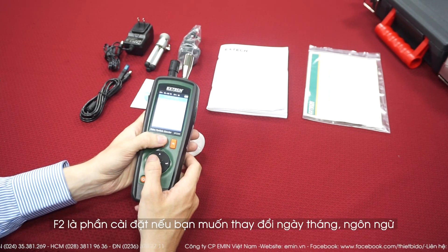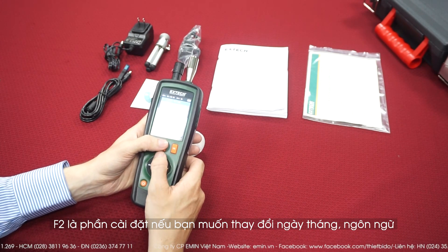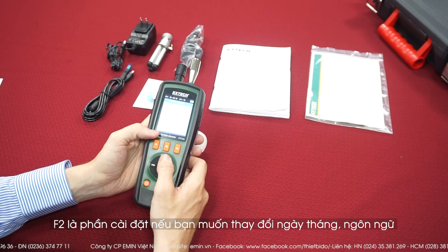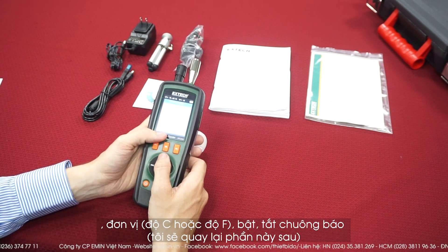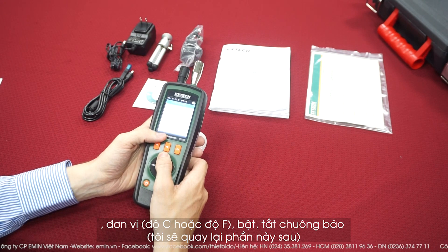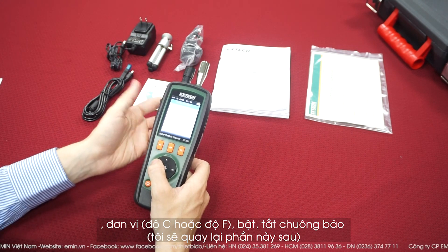F2 is the settings. If you want to change the date, time, the language, but also the units — depending on whether you're using Fahrenheit or Celsius degrees. You can also choose to turn on or turn off the alarm, but I will come back to this later.